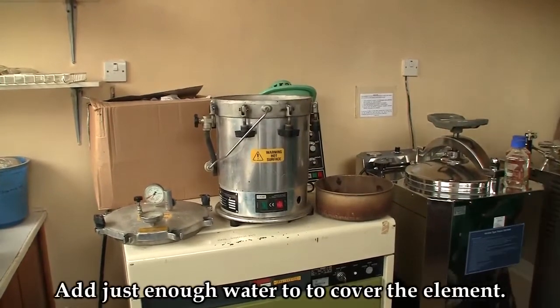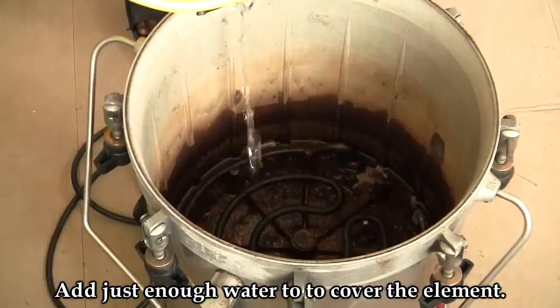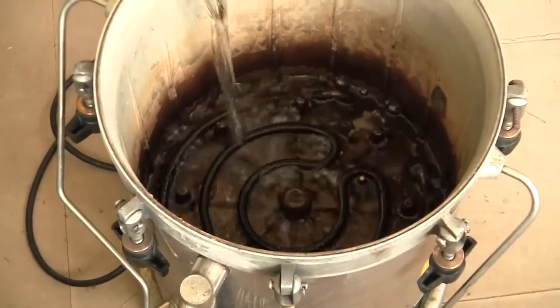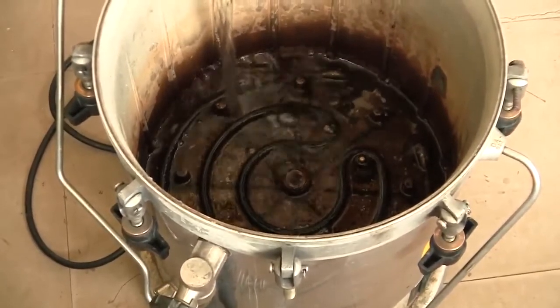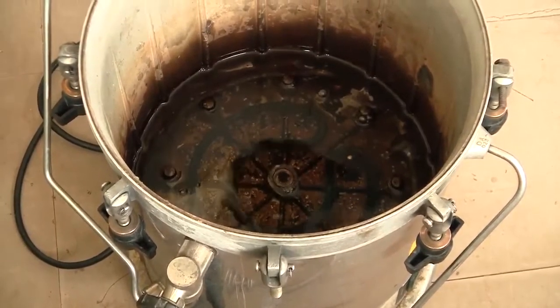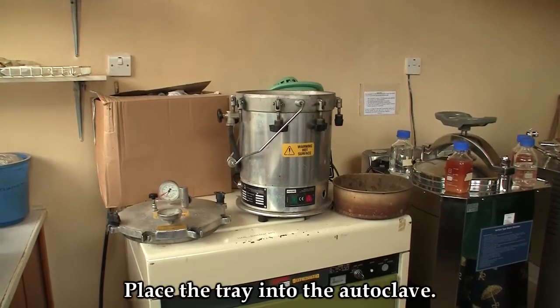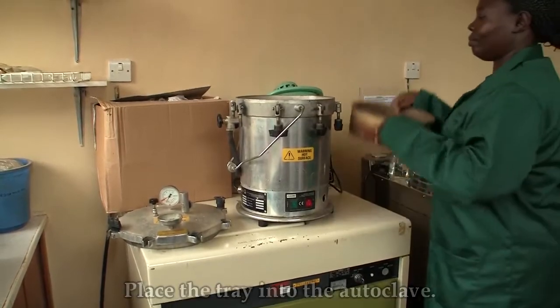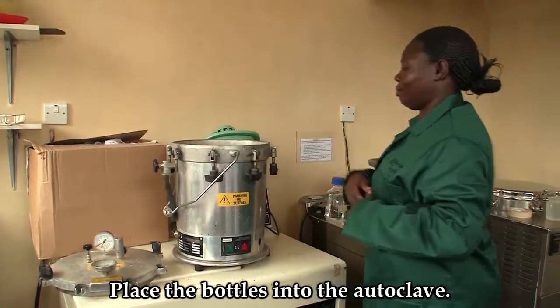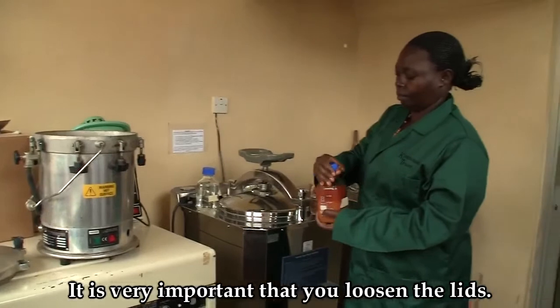Add just enough water to the autoclave to cover the element. Place the tray in the autoclave. Put the bottles in the autoclave, but ensure to loosen the lids.